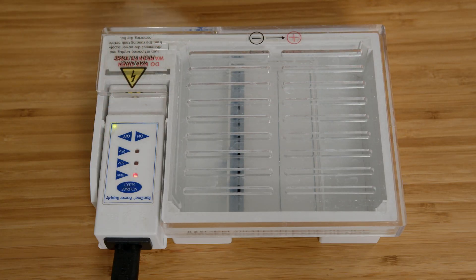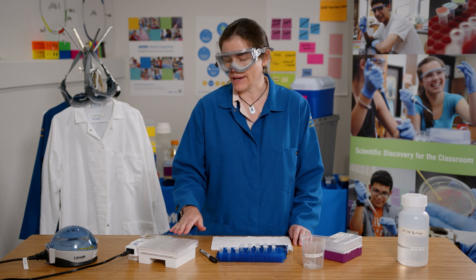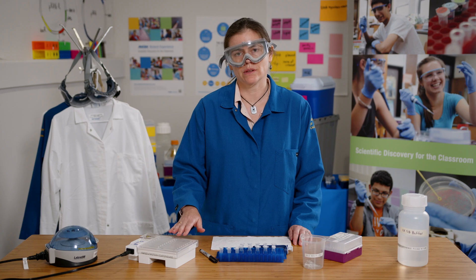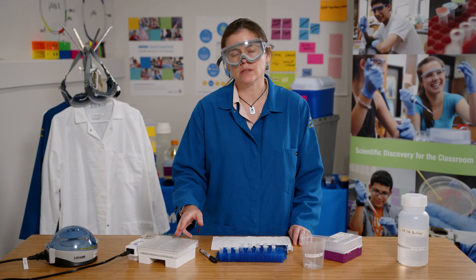Now I'll press on and make sure that the voltage is at 100 volts and allow the gel to run. Similar to lab 1.2, I need to watch where the yellow dye is in the gel. Once that yellow dye is about halfway to three quarters down the gel, I'm going to turn it off, because I know the DNA fragments are going to be between the small yellow dye and the much larger purple dye.